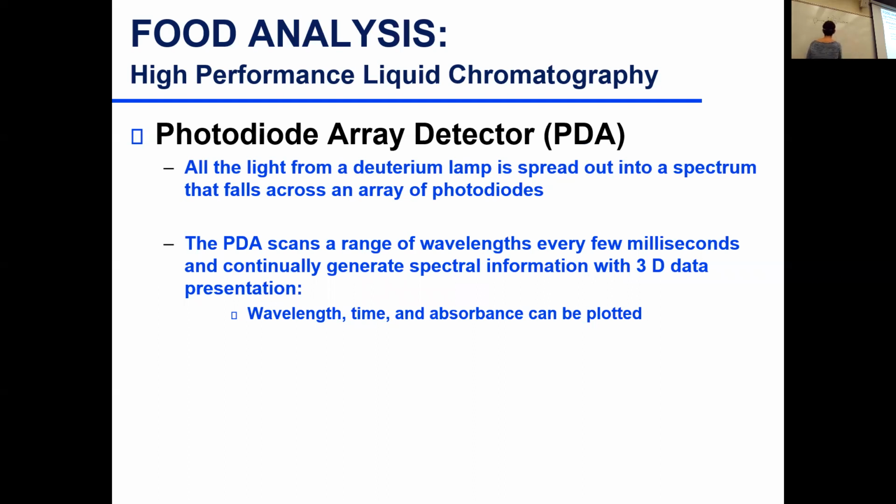You don't only get a chromatogram. This is a chromatogram, absorption over time, retention time. But at a particular time point, you can see absorption at different wavelengths.